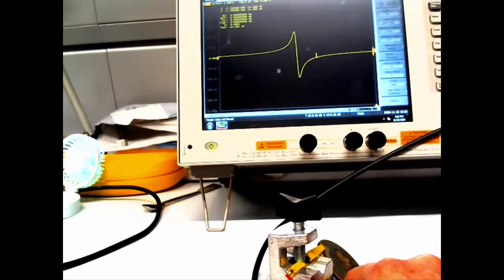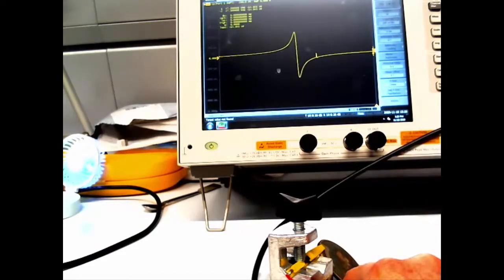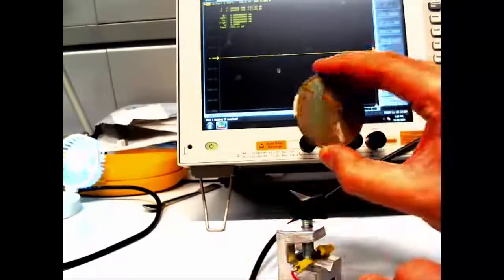That's what we will also see on a quartz crystal, but the quartz crystal oscillates at a much higher frequency. This is only kilohertz, and the quartz crystal is at megahertz. We can't hear the quartz crystal oscillating, and we have to be a lot more careful about keeping it clean, which is why I prefer these ones. It also is a lot easier. Okay, signal disappears. It's a lot easier to look at these ones.